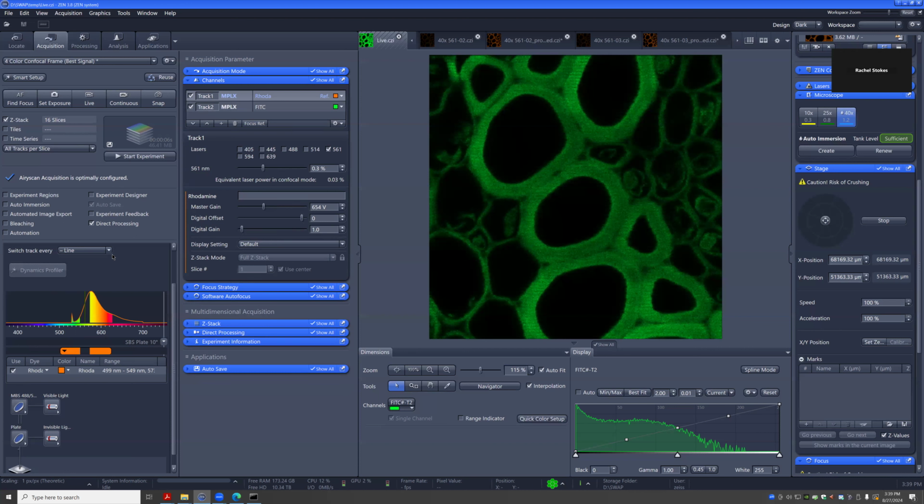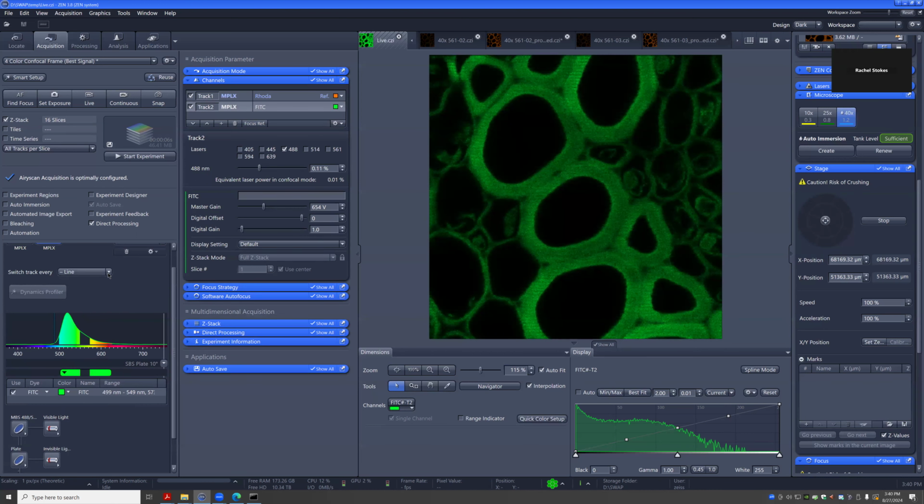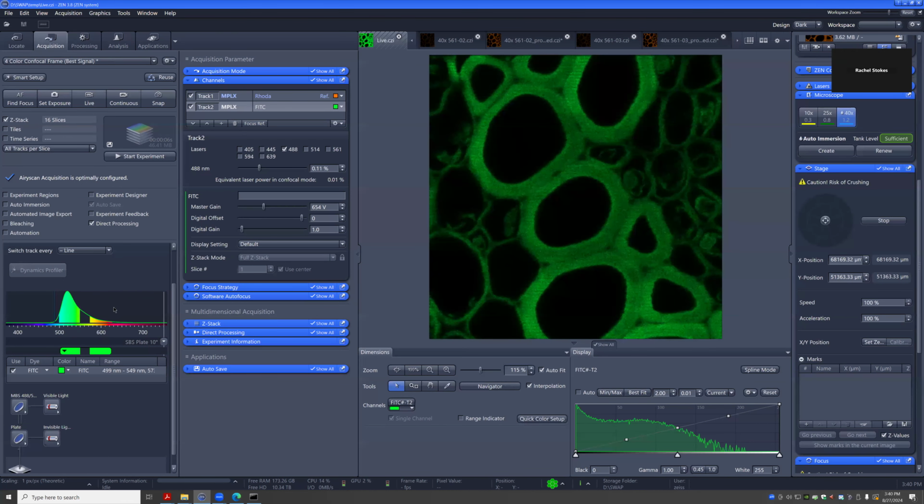Usually if I'm changing something in one track versus the other, it assumes, oh, you only want this for this track, and it'll swap back to frame mode because it knows you're modifying these parameters. So it sounds like you want to do different parameters between the 2 tracks, which is often the case. It is good to keep an eye on that because it'll try to help you, but if you're trying to adjust something to make it fast with line mode, you want to make sure it keeps it modified like that. This experiment line with this filter with this particular MBS should be totally fine.